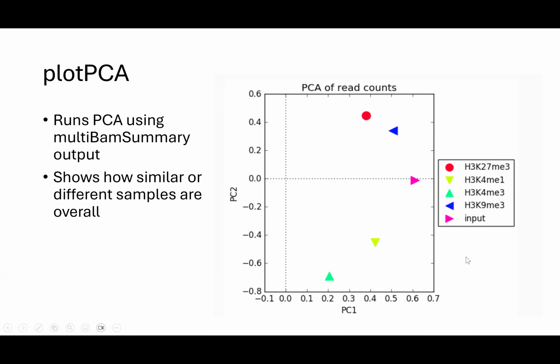So this can give you, again, another early sense: did my experiment kind of work as expected? And then if you have an experimental perturbation, you'd expect those samples to cluster with each other as well.